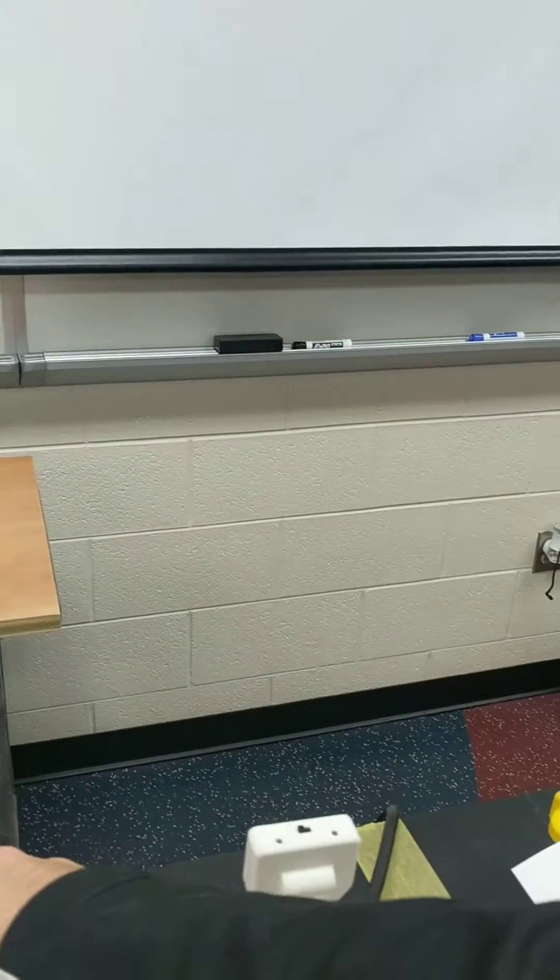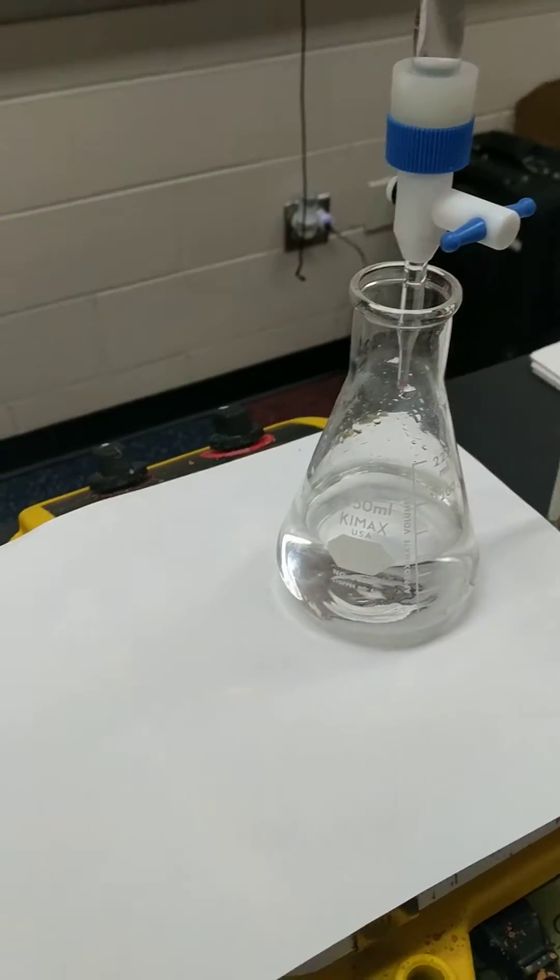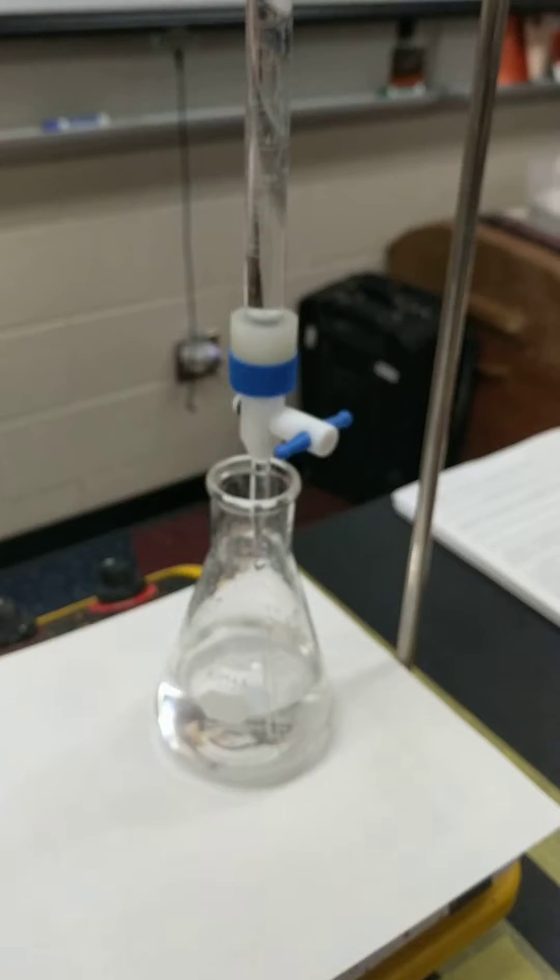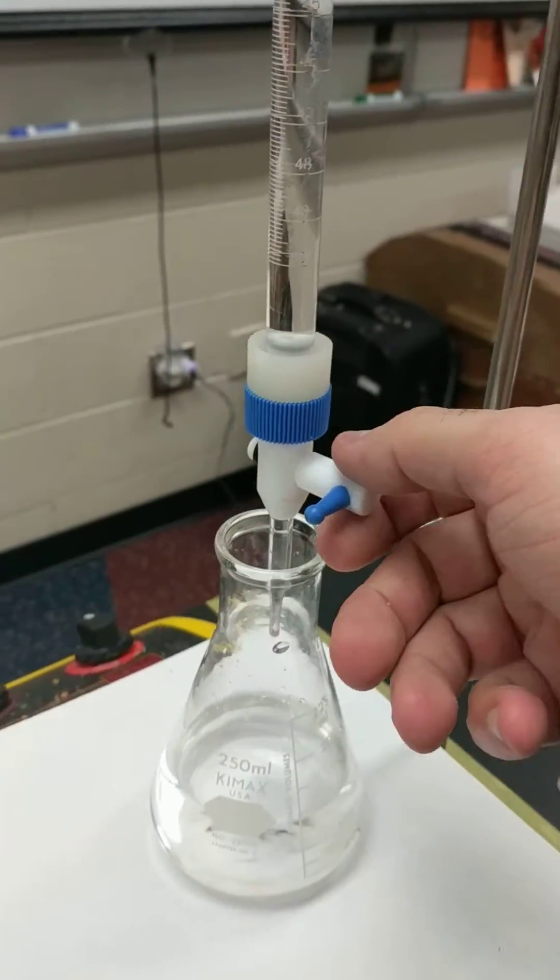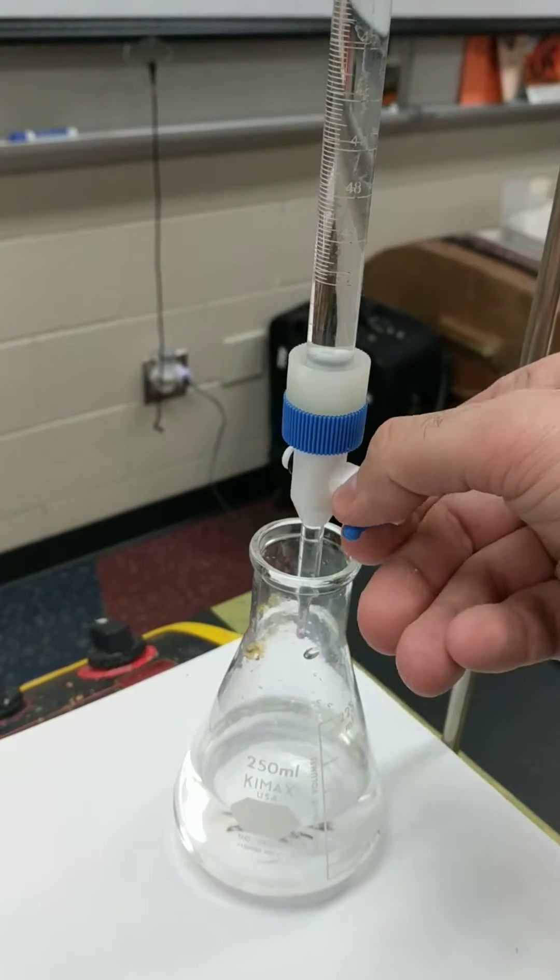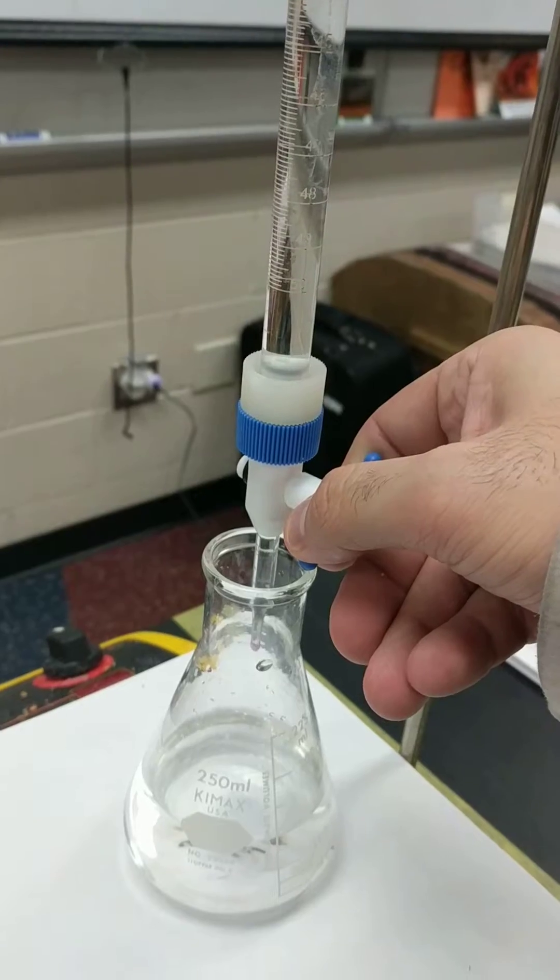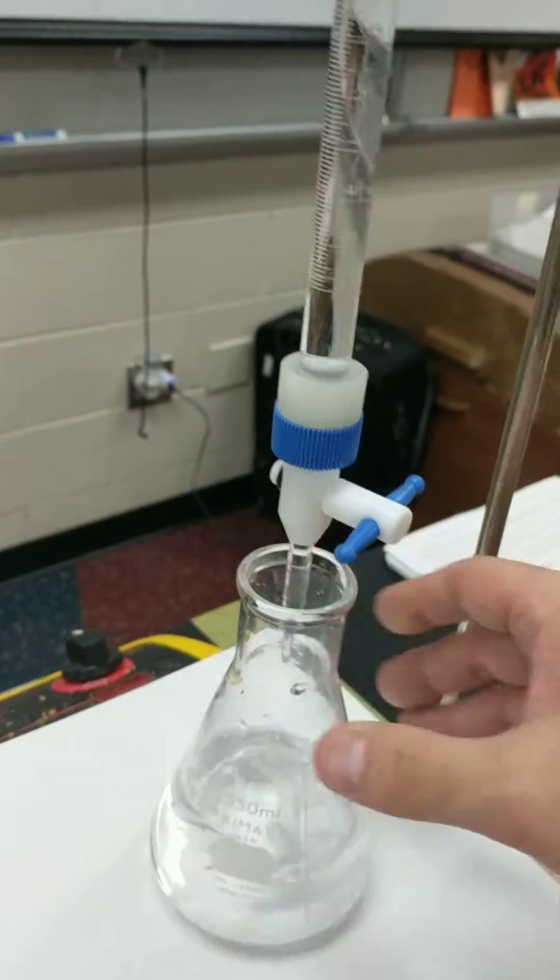So I wanted to show you what a nice faint pink endpoint would be. In this example I have here, I already started dropping the titrant into here. I used a lot of solution, and now I'm going to show you that I'm just going to drip a little bit at a time, not a lot. So I'm opening the stopcock just a little bit so it drops a little bit. So look, I did two drops and the color disappears.